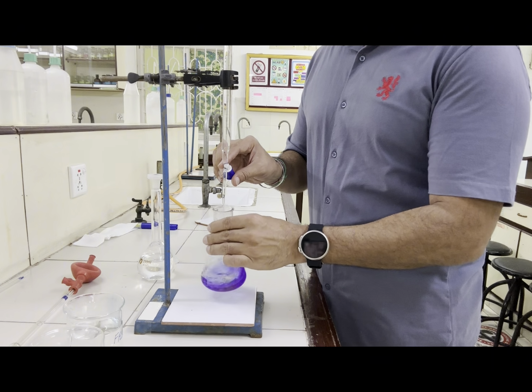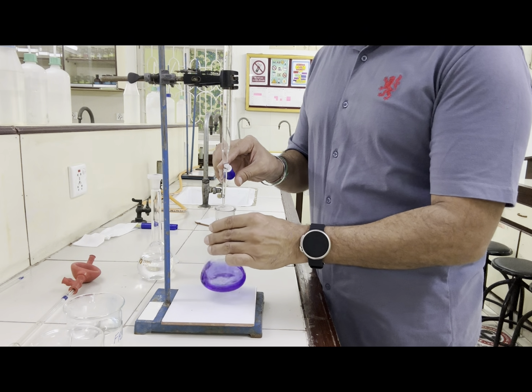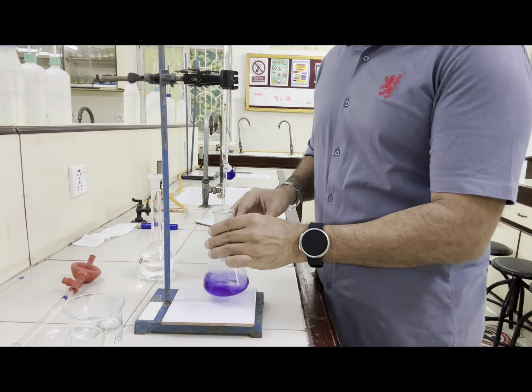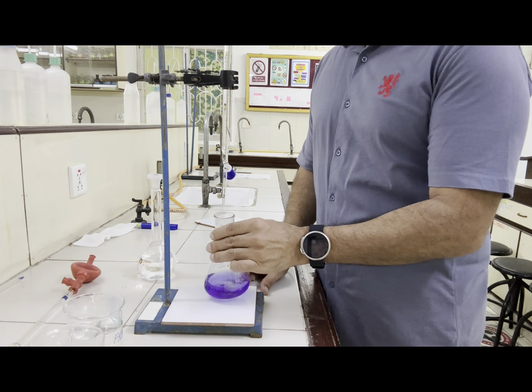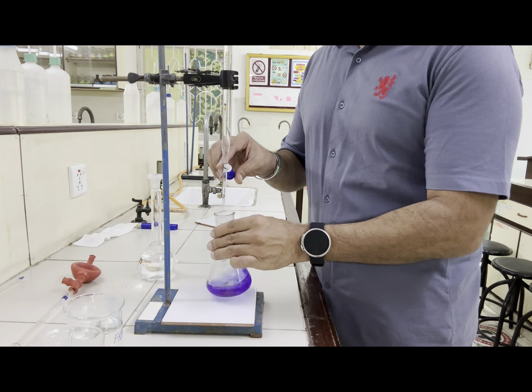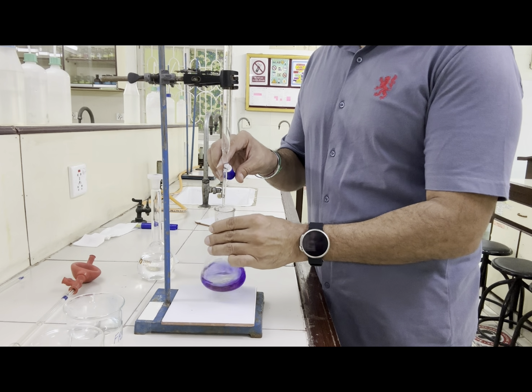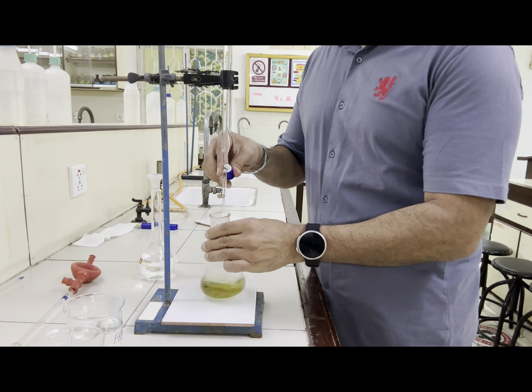You can also take the volume according to your previous titration results. Now I have slowed down because it's getting lighter, and dropwise you can see, you will keep swirling continuously, and as soon as the solution turns yellow, and here you go.